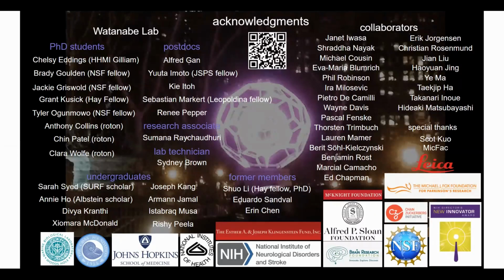All right, so Shigeki, I have a question for you here, and it's a two-part question. Can the high pressure method be used for every type of cell? And can you get these beautiful images from every type of cell, or are there favorite cell types? Okay, great question. So technically, you can use any type of cells. It's just that there's a limitation in terms of the depth of the tissue.